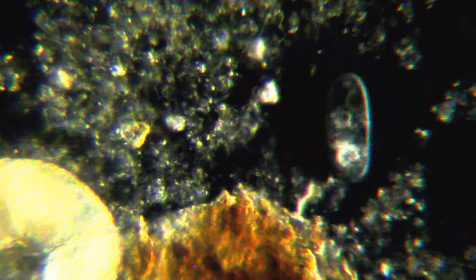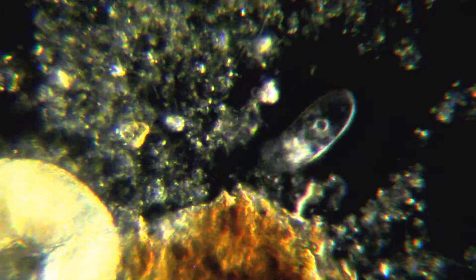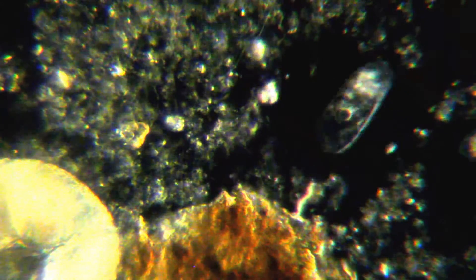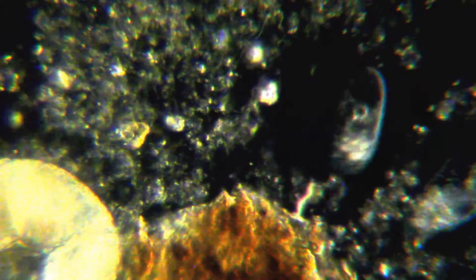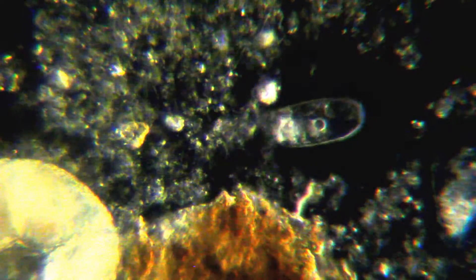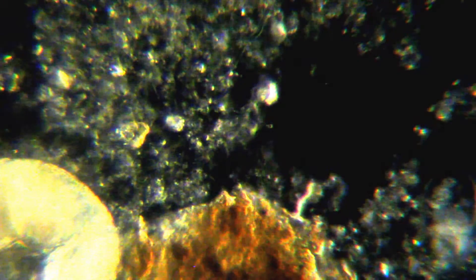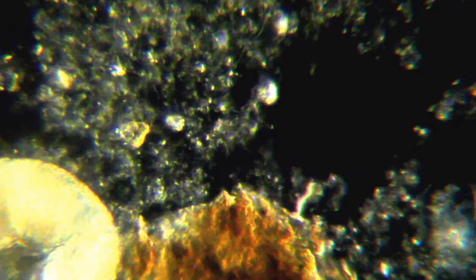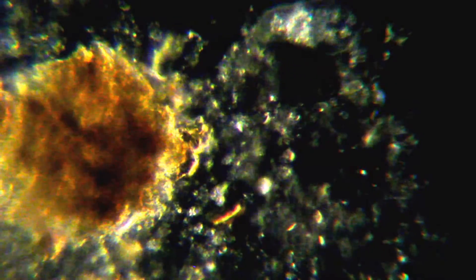I thought I'd do an update video on Darkfield and the new used Zeiss turret condenser that I bought. It had a problem fitting on my Amscope 490B because the turrets on that are supposed to sit on the bottom of the condenser holder, but this one mounts on the top. I found out that perfect alignment of the turret is critical, and I had to remove a piece on the bottom of my microscope stage to get it to fit and be able to bring it all the way up to the slide, which is also critical for good Darkfield.